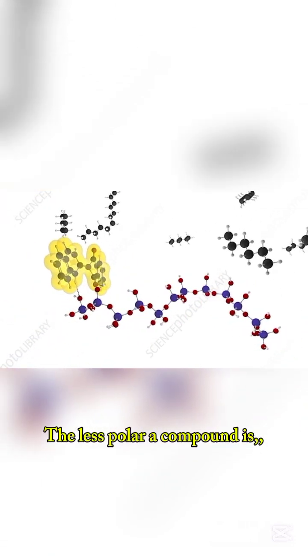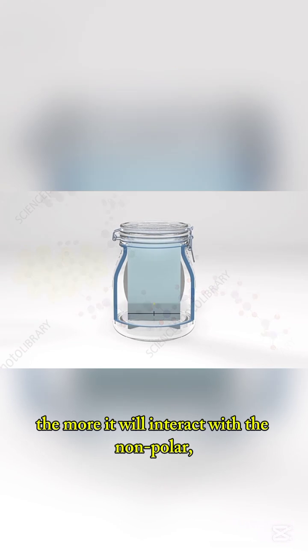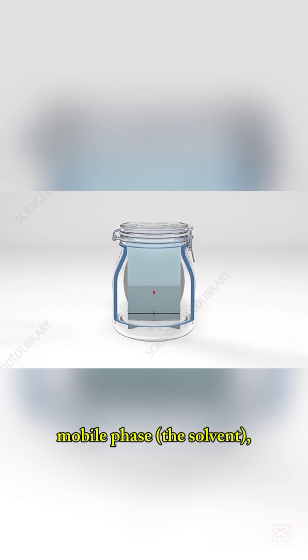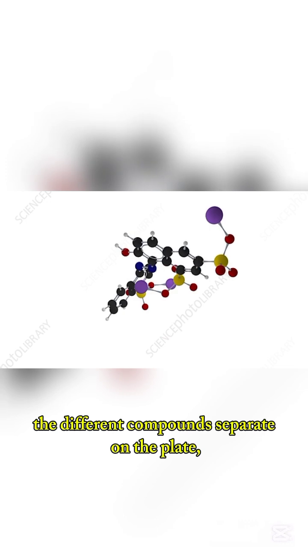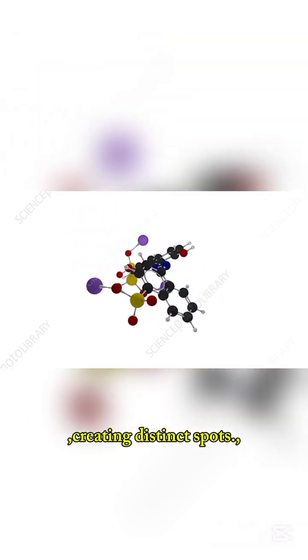The less polar a compound is, the more it will interact with the non-polar mobile phase, the solvent, and move faster. As a result, the different compounds separate on the plate, creating distinct spots.